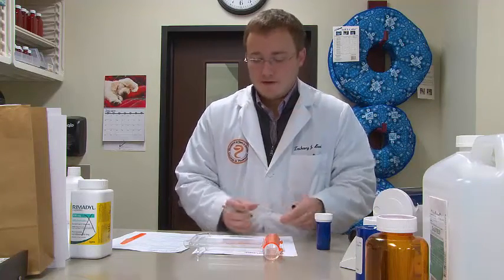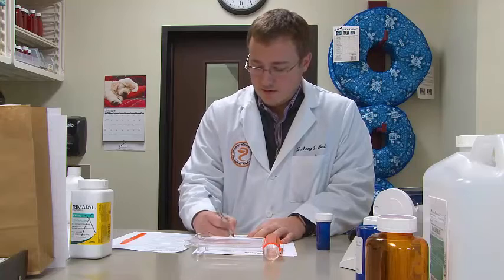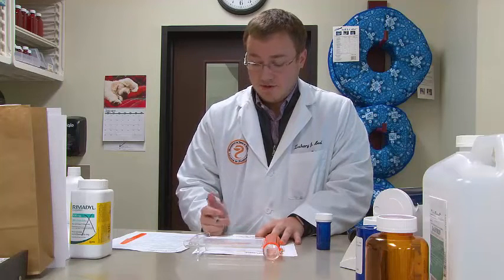Now that we have our drug counted and packaged, the next thing we're going to do is fill out our label. I have a blank label here. The first thing we want to write is our date — today is 1-23-17, so I'm going to write that down. The next thing is the prescribing doctor's name. For this patient, it is Dr. Amy who wrote this prescription — if you have a last name, make sure to include it. The next thing is the name of our patient. This medication today is for a dog named Sammy, so I'm going to write Sammy down.